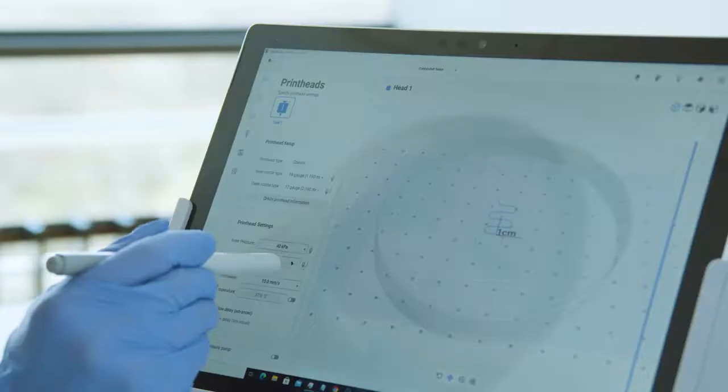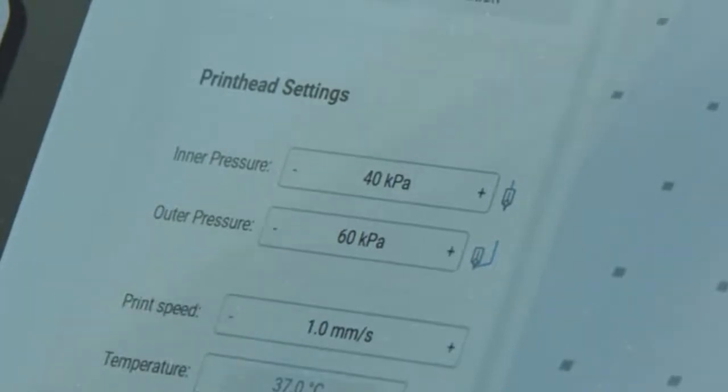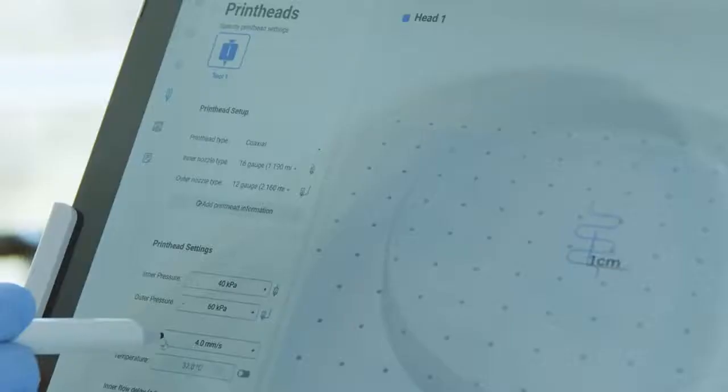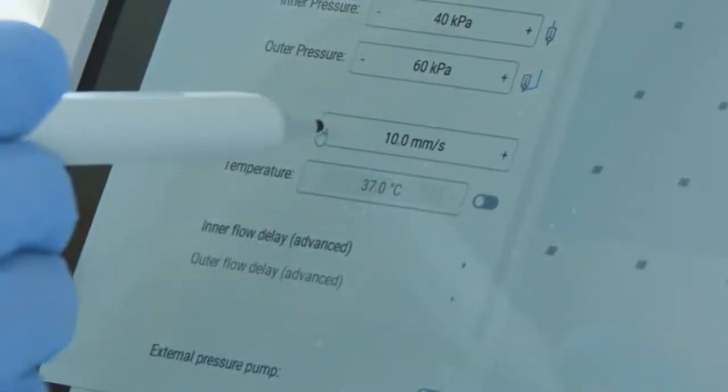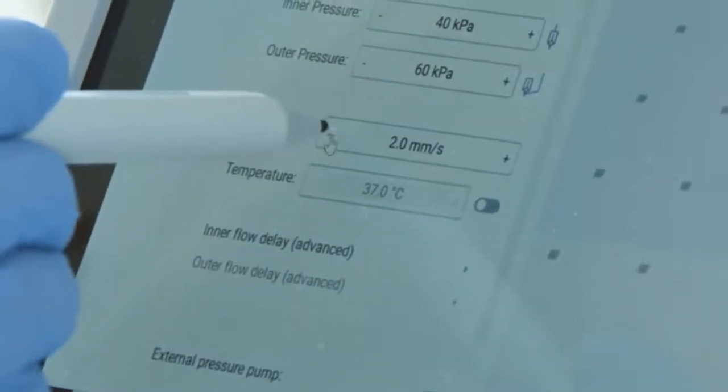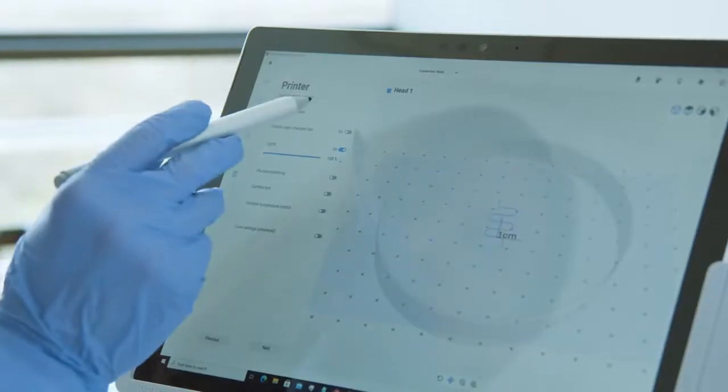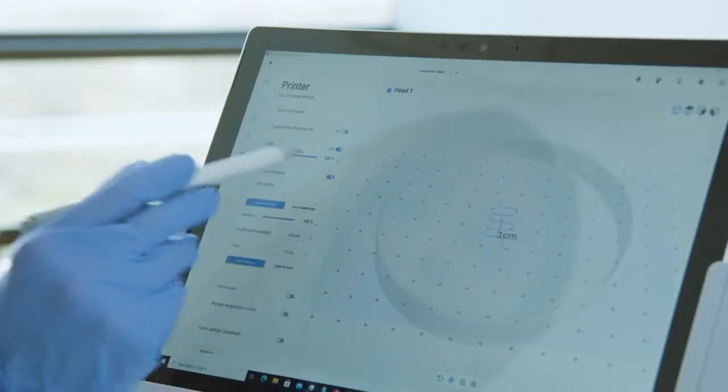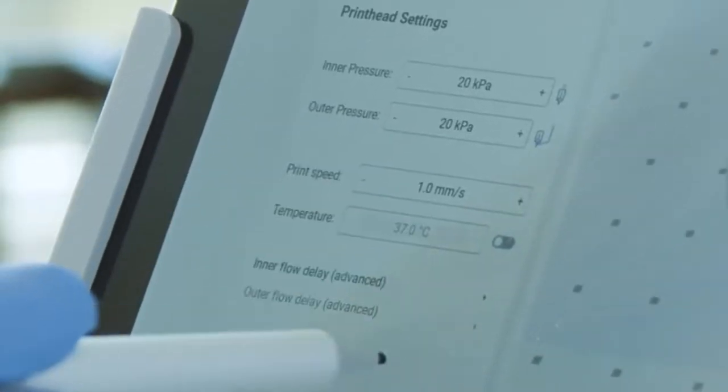Here you can adjust the pressure for inner and outer nozzles. Then adjust the print speed. I recommend you to start from low print speed, usually one or two millimeters per second works well for different bioinks. Meanwhile you can further adjust during the bioprinting process as well. You can also adjust the temperature here.